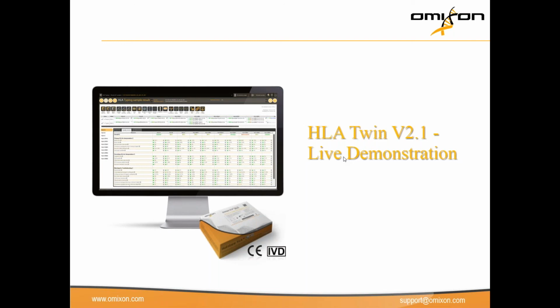So another one, just the last one for now. It has to do with sample number. So the question is, if we reduce the sample number and use a full flow cell, can we expect better results, or maybe it's similar to a micro flow cell? Yeah, it's a funny question though, because the full flow cell accommodates up to 100 samples. So if you reduce the numbers, it doesn't really add anything because there's so much data in there, but the micro flow cell works fine as well. It's just giving you much more than needed. And 8 samples on a micro flow cell is really, really fun.